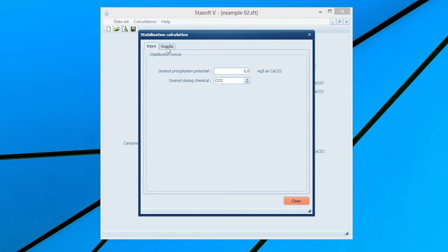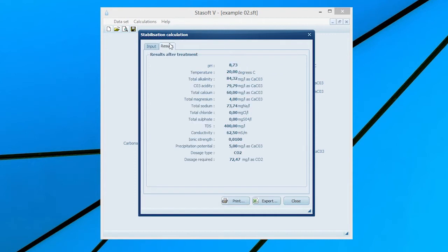Enter the specified final calcium carbonate precipitation potential of 5 mg as calcium carbonate by typing 5 into the desired precipitation potential input box and select the Carbon Dioxide option. Selection of the Results menu option will bring the Results After Treatment window onto the screen with values for the new state of the water and the dosage of carbon dioxide required to adjust the water to the specified calcium carbonate precipitation potential.